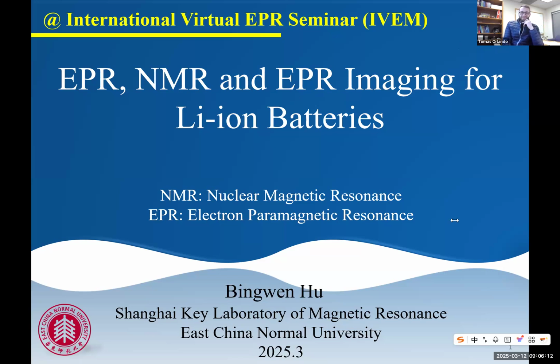Okay, thank you for the introduction, and nice to meet you, everyone. Today I will talk a little bit about how to use NMR, EPR, and EPR imaging for lithium-ion batteries. I come from East China Normal University, and maybe after 2 or 3 minutes, I will turn off the camera so as not to use too much bandwidth.